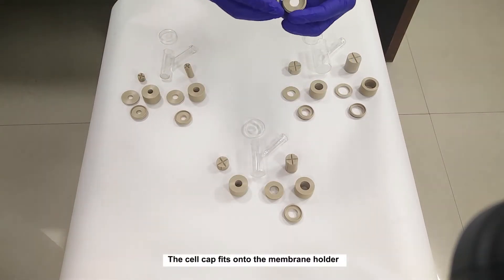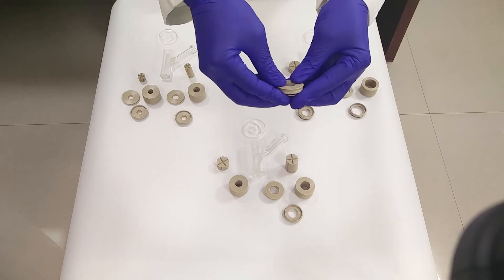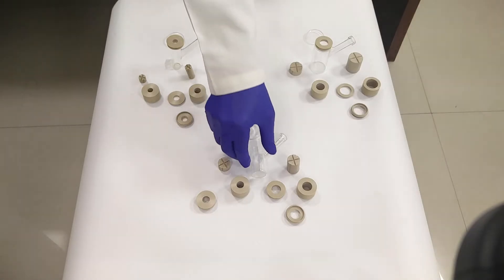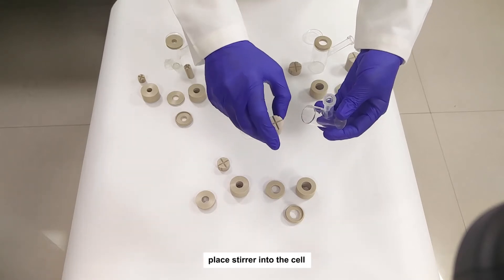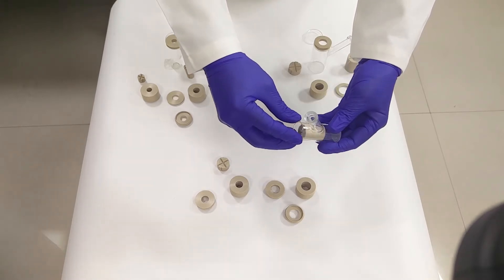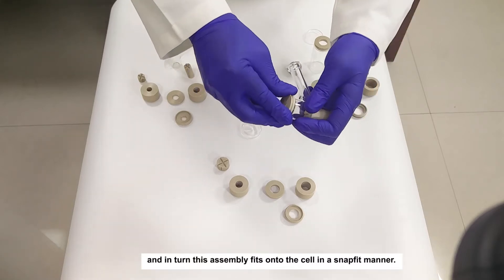The cell cap fits onto the membrane holder. Place the stirrer into the cell, and in turn, this assembly fits onto a cell in a snap-fit manner.